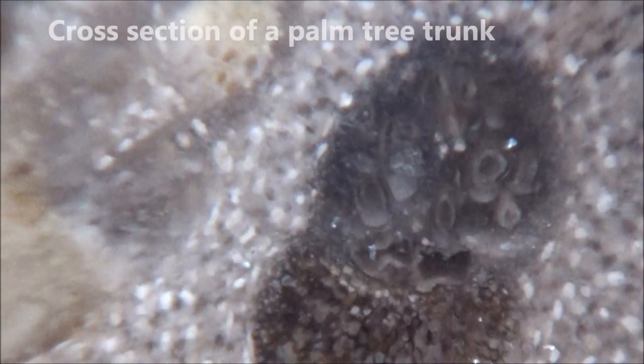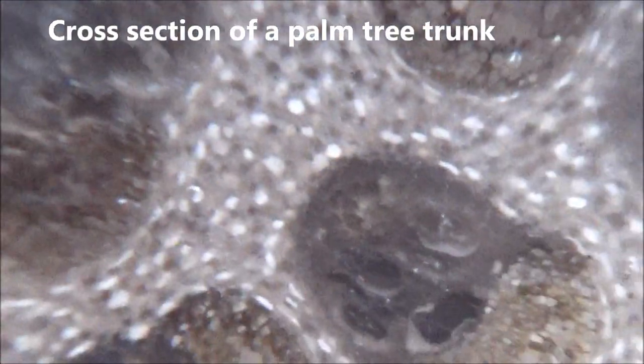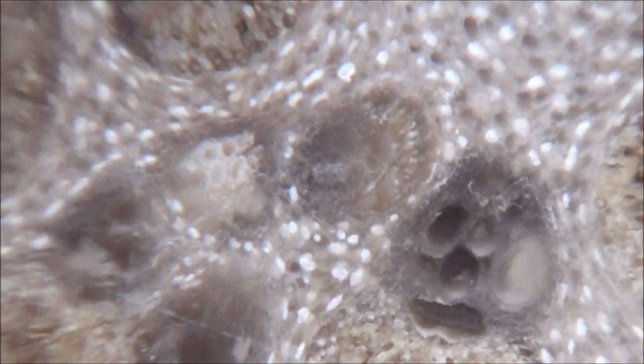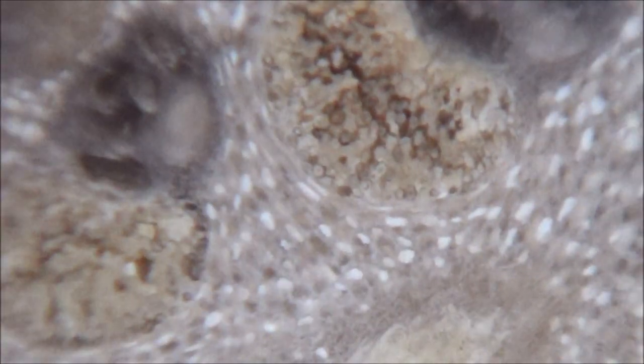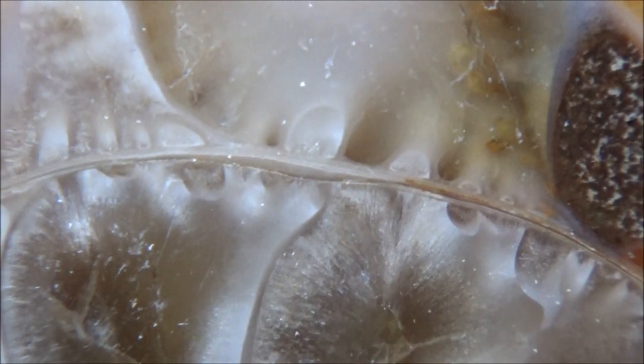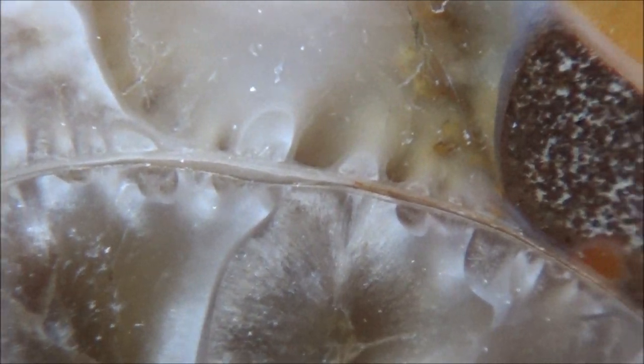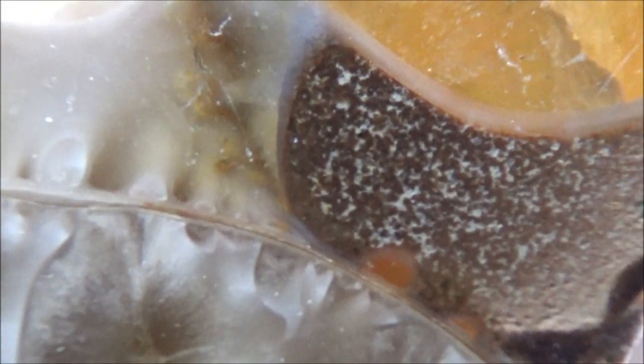A palm tree from Texas has quite distinct fine structure. The fine structure of septa from an ammonite shell.